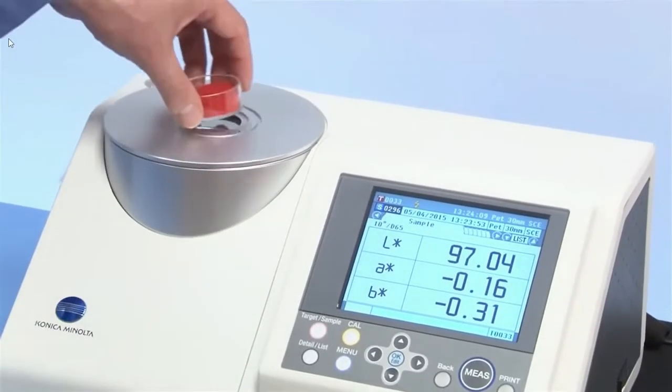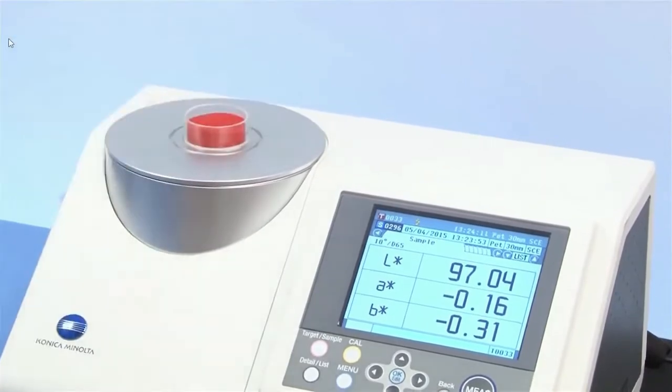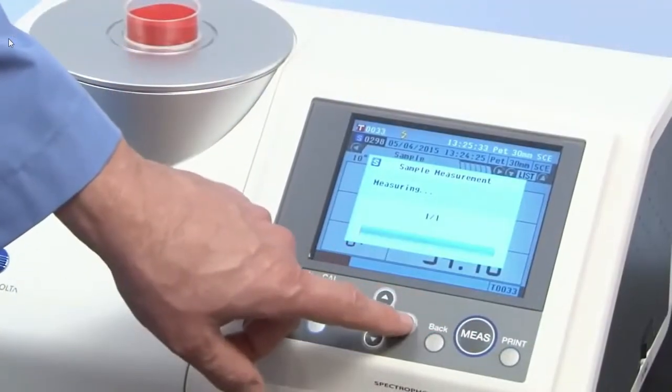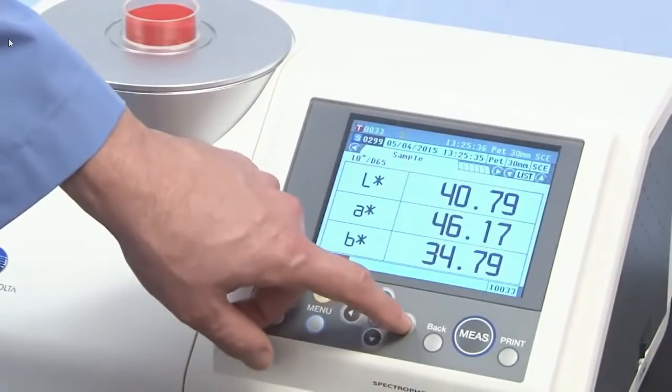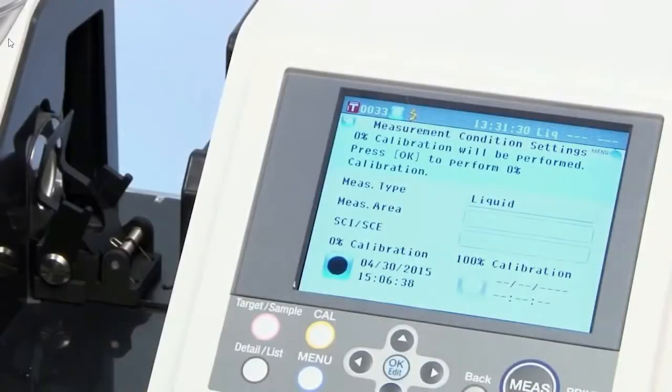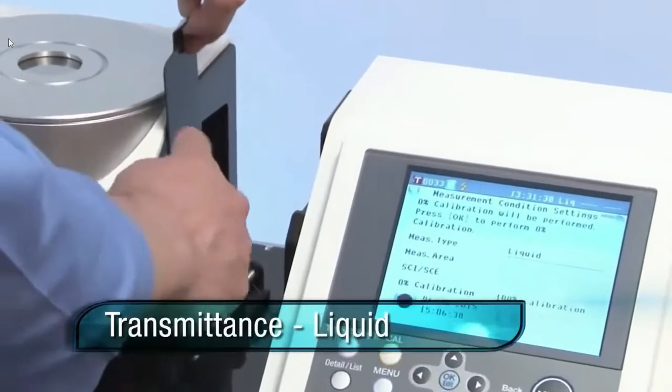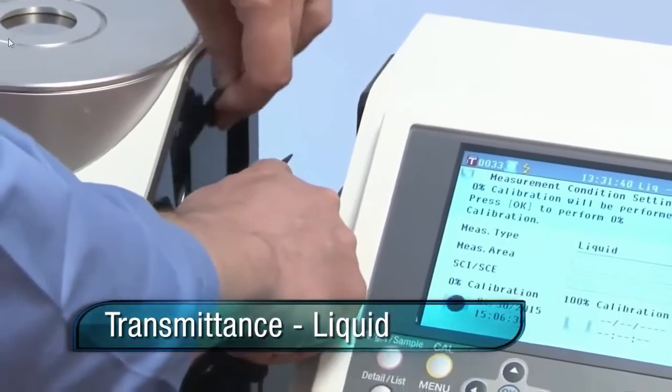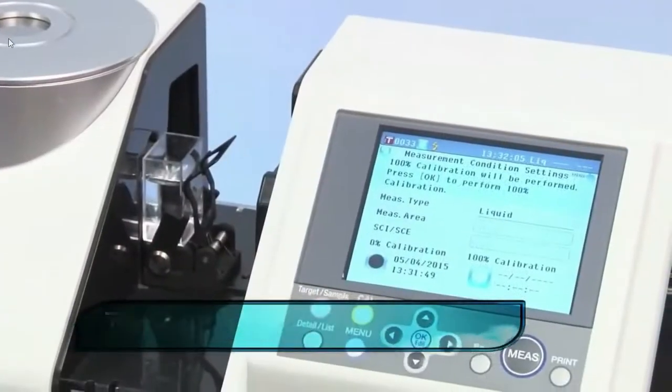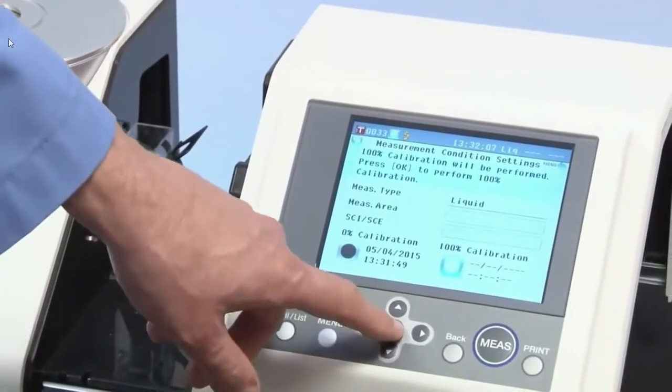The liquid mode will guide you through proper sample preparation, which includes zero calibration inside the transmittance chamber, as well as a simultaneous white calibration, clear water, and cell holder calibration procedure before measurement.